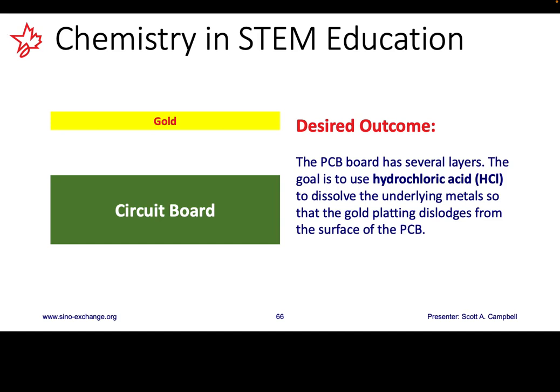At this stage, you can pour the solution into a clean beaker. Keep the solution though, as it needs to be filtered to remove any gold before disposing of the waste solution. Next, use thick rubber gloves and a water spray bottle to wash the PCB scraps. Make sure that you inspect all PCB scraps to ensure that there's no gold remaining on the surface of the PCB boards, and if there is, you'll be able to easily rub it off manually at this point.